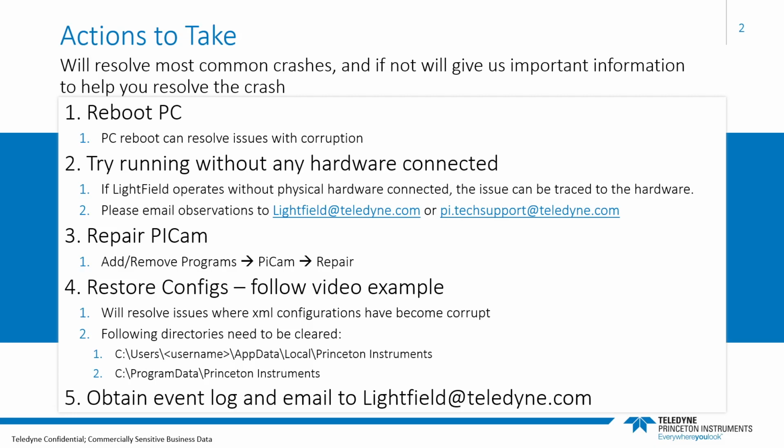If rebooting the PC doesn't work, then you want to try running LightField without any hardware connected. What this is going to do is show us whether the issue can be traced to hardware. If you have nothing connected and LightField can turn on, then you can email these observations to lightfield@teledyne.com.